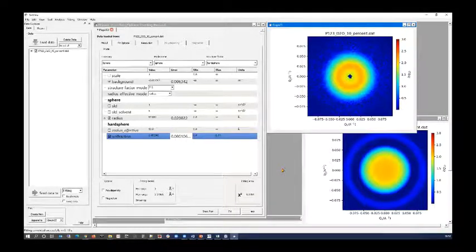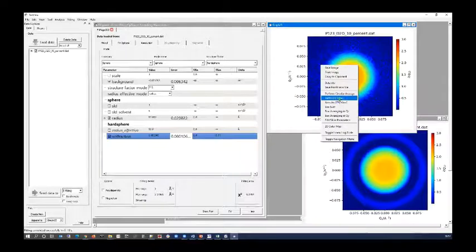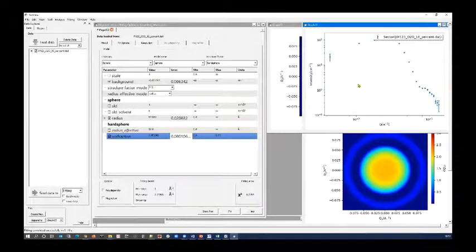Okay, so hopefully now you'll agree that actually maybe they aren't quite as dissimilar as you initially thought. So you can do 2D fitting in SasView. When you're doing 2D fitting, you can also do some derived 1D plots using what we call slicers. If you right click on the plot, it gives you the option for some various slicers. So for example, you can do sector slices.